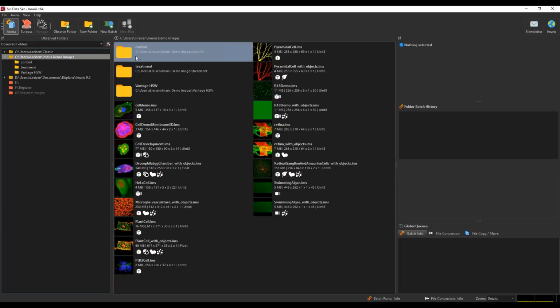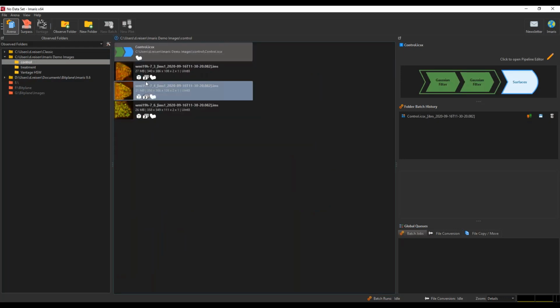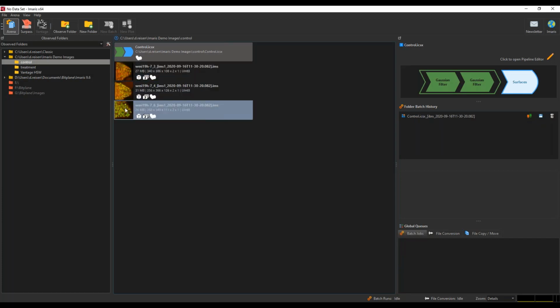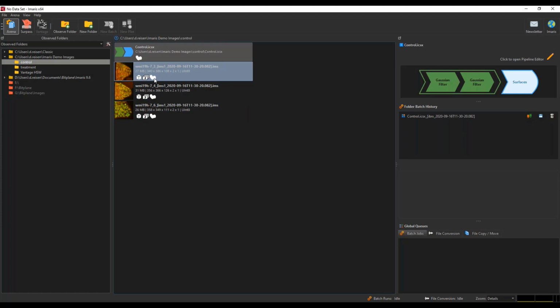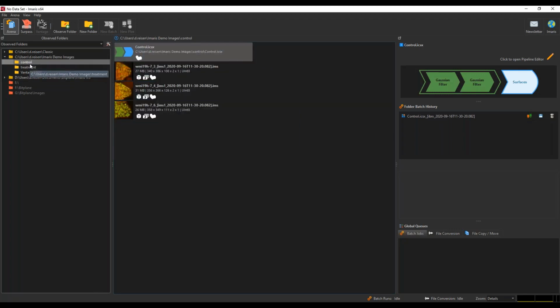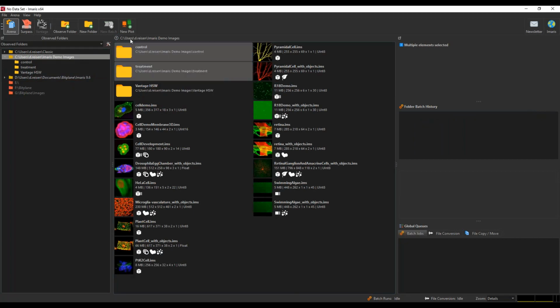Yeah, so comparing actually the data sets, so I used in my presentation actually the ones I had previously batched, but they don't need to be batched. You can just have actually here a folder with your segmented objects. It can be spots, surfaces in this case, filaments, or even the cells, cell compounds. So they need to be the different folders, and you just select actually the folders and do the new plot here. So it's really very easy whenever you have a population of segmented objects. Just bear in mind, put them in a folder, and then you can do the plot directly from here to compare these data sets. Yep.